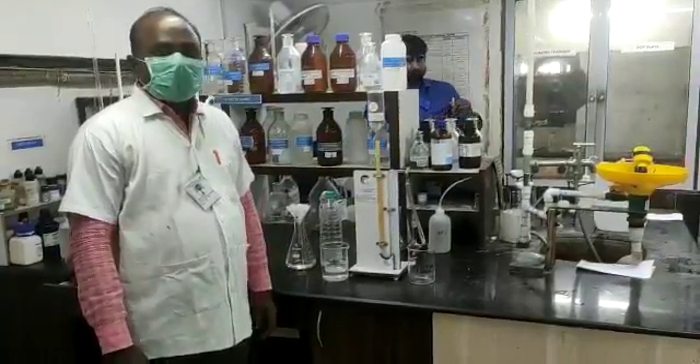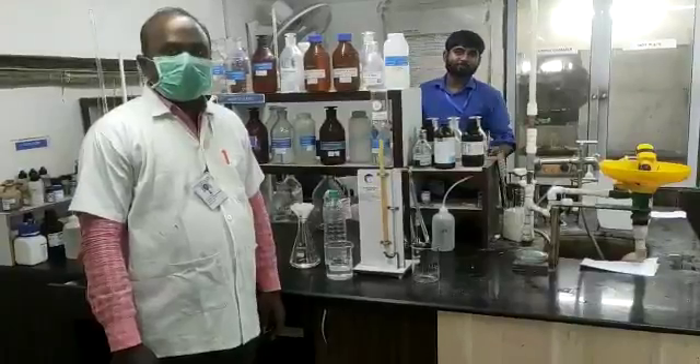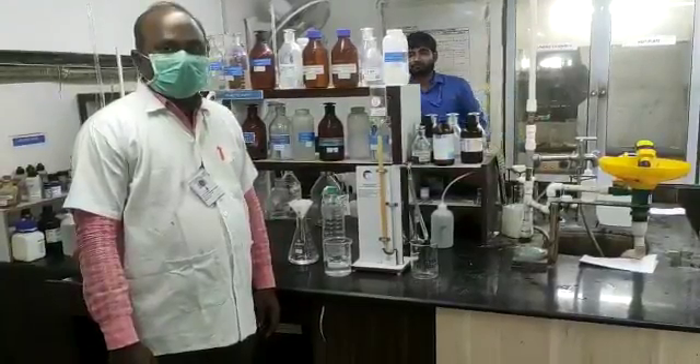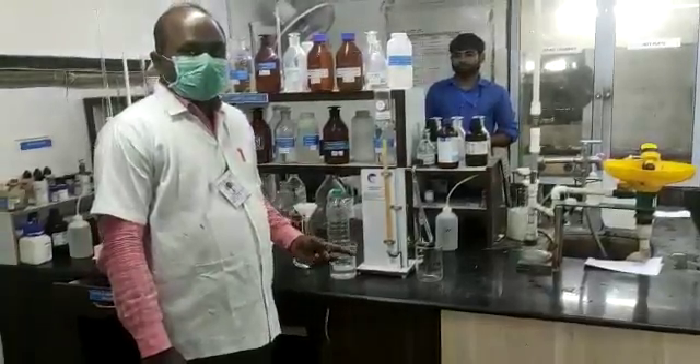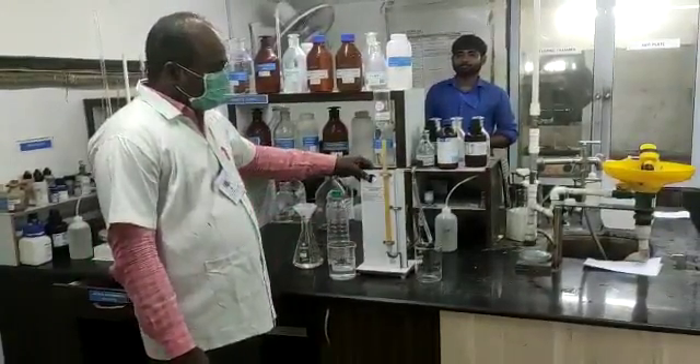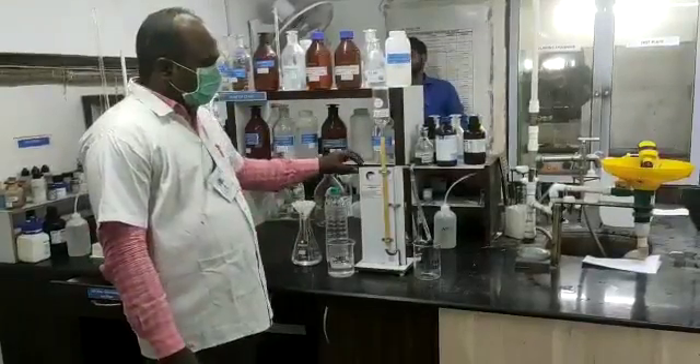Three methods are available: number one is gravimetric, number two is the thorin method, and number three is the turbidimetric method. I have selected the gravimetric method, as per IS3025 Part 24, which mentions the gravimetric method.